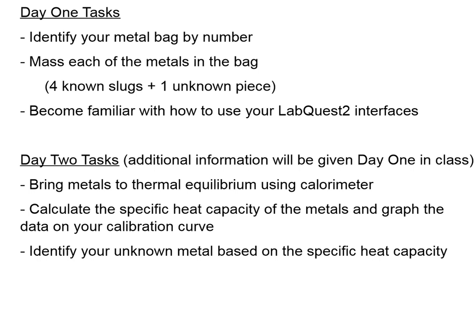And again, how you're using the LabQuest 2 is going to play a role in my description of your lab tomorrow. So probably you'll come in, you'll get your metals, you mass each metal. After you've massed your metals in the bag, you're going to return the metals to me, and then we'll have a seat and we'll get working on how you're doing your lab, including how to use your LabQuest 2, and then if there's time the rest of the period, you can go back and play with the LabQuest 2 and play with the interface, the temperature probes, so you know what you're doing with it.